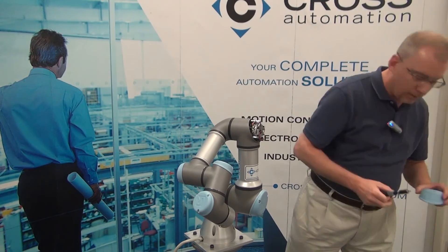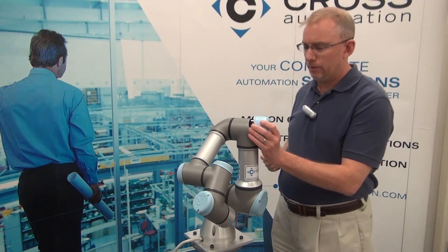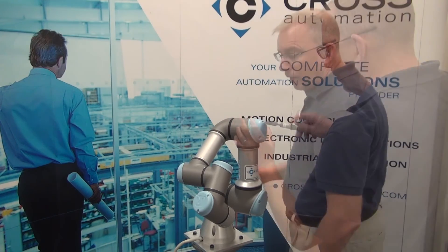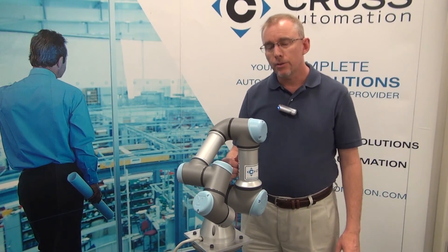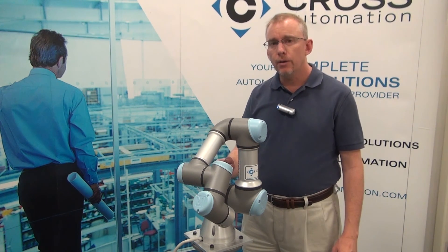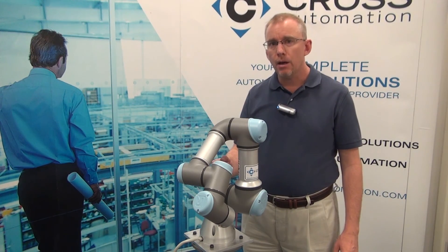Lastly, we're going to reinstall the blue lid, torquing it down to 0.4 Newton meters. As your last step, you will go in and perform the calibration as described in the service manual. This concludes our instructional video. I hope you've enjoyed it. Please check us out online at CrossRobotics.com.